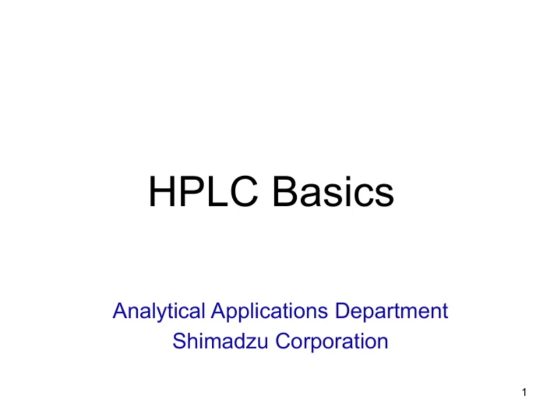Today's presentation is about the Analytical Applications Department at Shimadzu Corporation. The focus will be on HPLC basics, which are fundamental to our work. Over the next few slides, we'll explore key concepts and applications of HPLC technology.